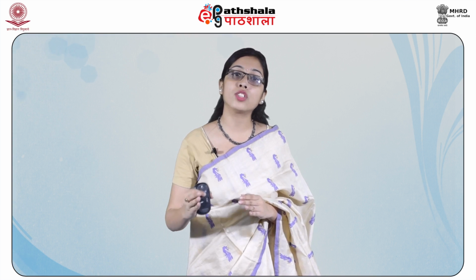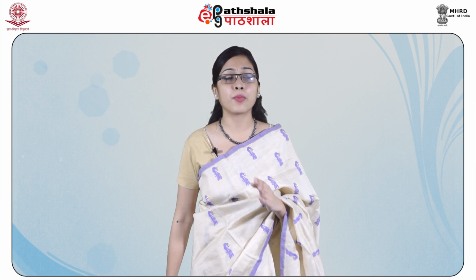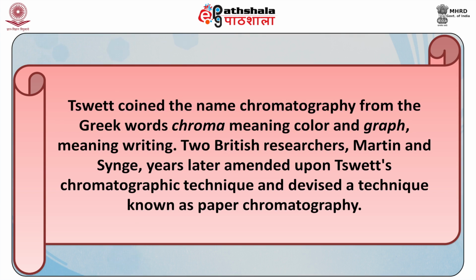The sample was allowed to travel through the column along with the solvent under gravity. The components of the plant pigment mixture separated into different colored bands in the column. Tswett coined the name chromatography from the Greek word chroma meaning color and graph meaning writing.